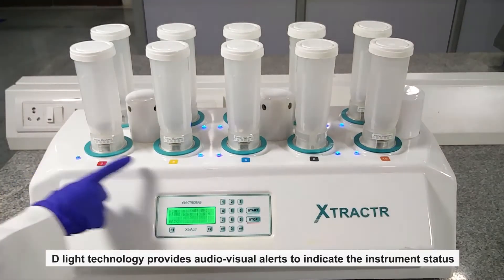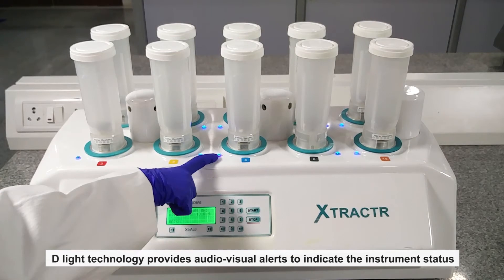D-Lite technology provides audio-visual alerts to indicate the instrument status.